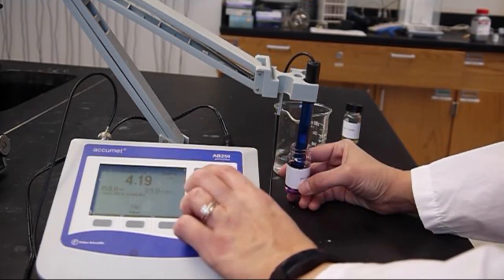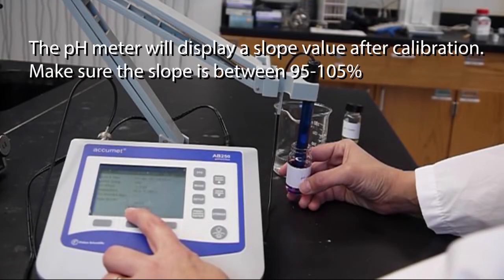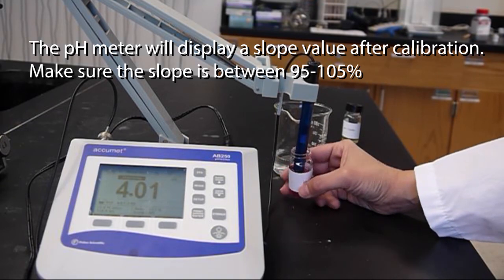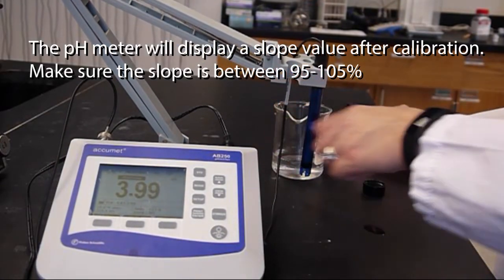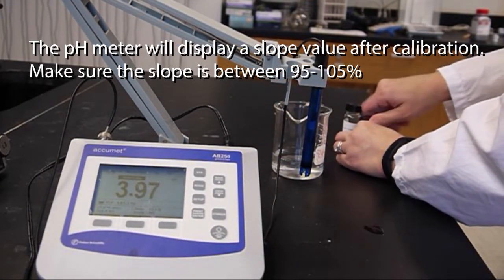So it says stable, so press STD. Now we have calibrated with a pH 4 and a pH 7 buffer solution. So our pH meter is ready to go.